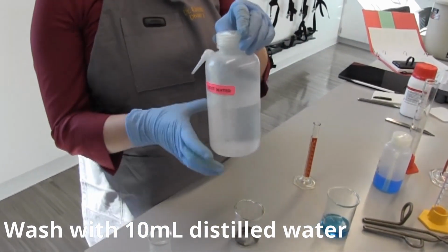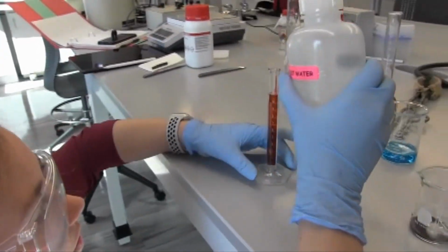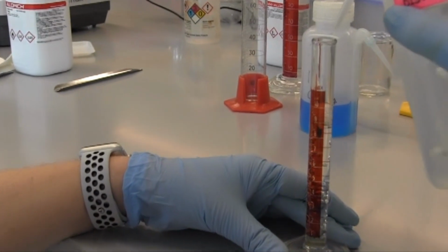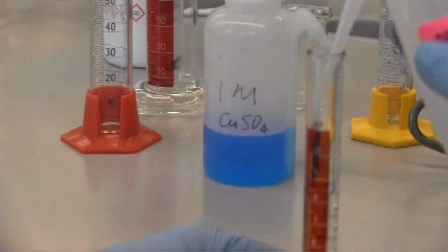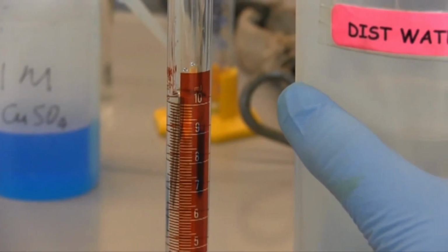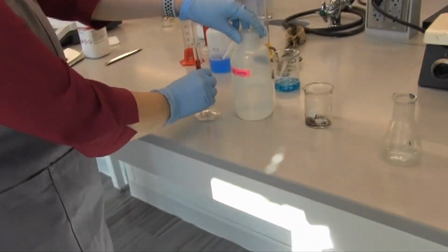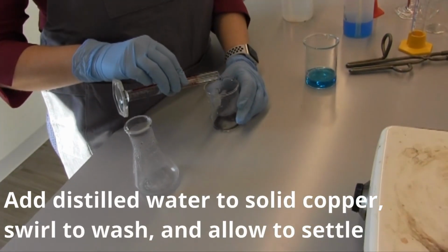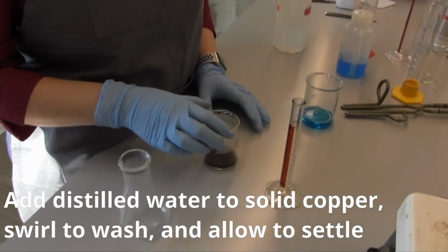Use a graduated cylinder to measure about 10 milliliters of distilled water. Add this distilled water to the solid copper and swirl it around to wash any remaining ions from the copper.